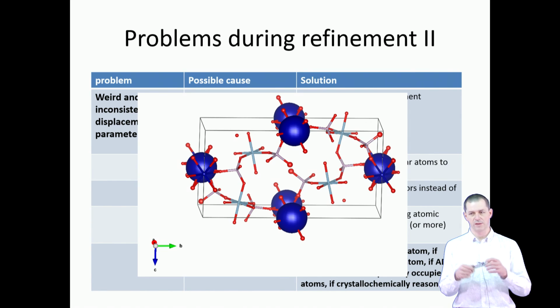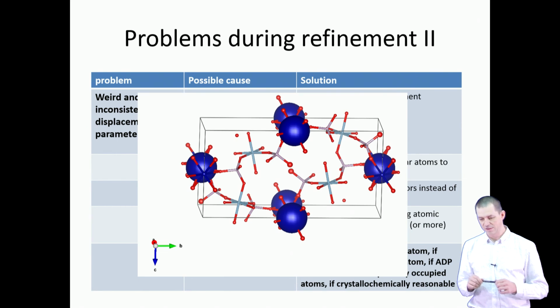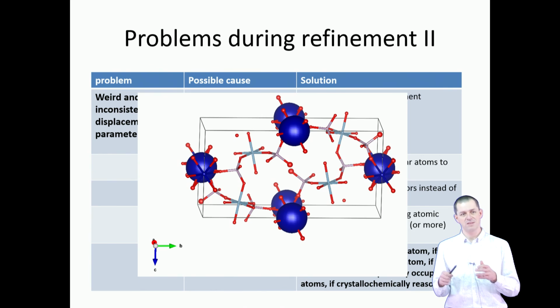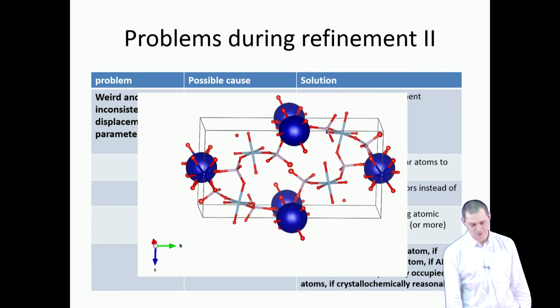We had a look at a structure yesterday with one of your colleagues, and there seems to be a chlorine atom which has more than 100% occupancy. Well, that is certainly not possible. We still do not know what is the reason for that. But there are things that may improve the refinement but can't be done because they are meaningless from the point of view of chemistry.